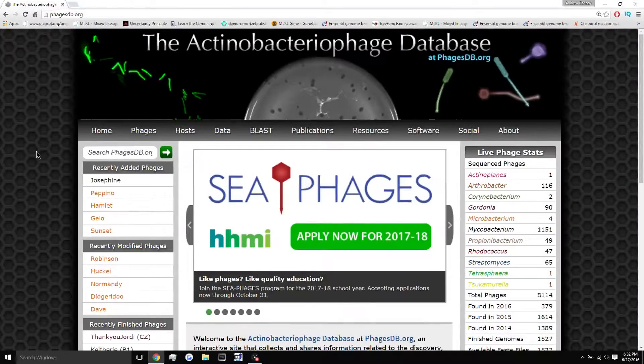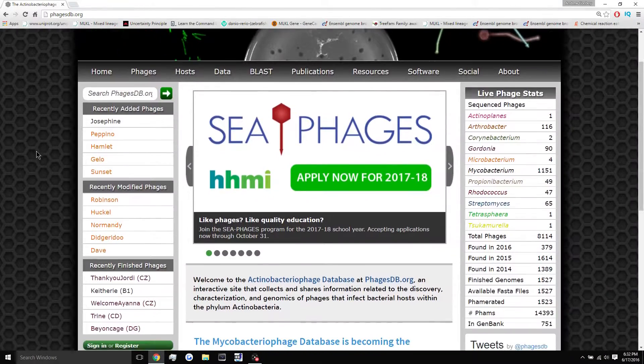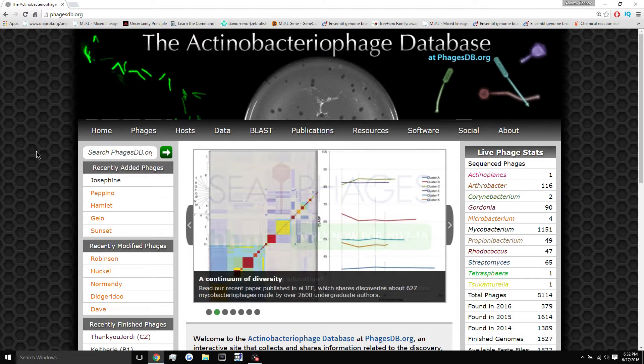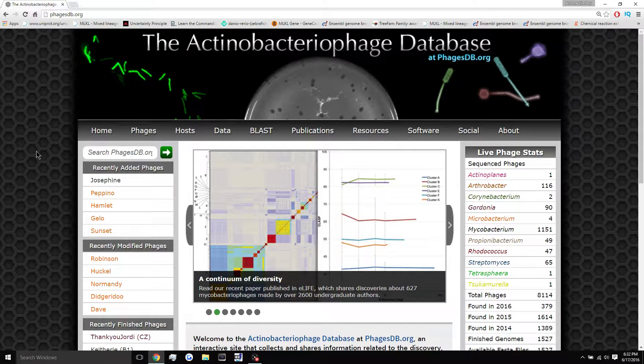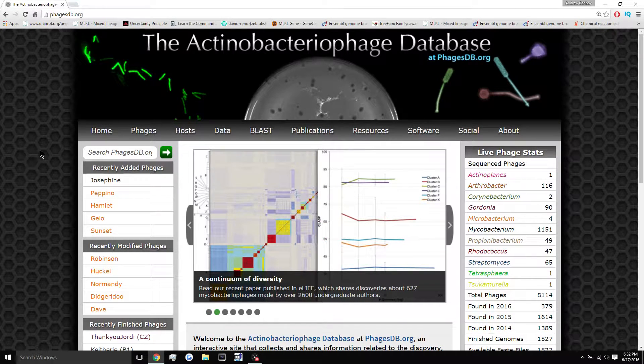Hello everyone, welcome to your first DNA Master tutorial. Today we're going to be showing you how to obtain DNA Master, how to get it running and installed on your Windows machine.